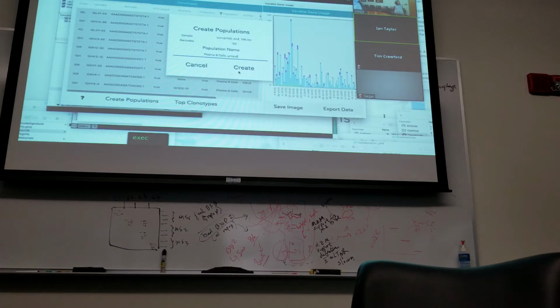We would be really interested to learn the things that you want to do that we currently can't do. Some things that I wrote down: Circos plots, and digging deeper into these subpopulations, even within the comparison, because we set up originally naive, memory, and plasma, and we want to then look at the different patients within that.